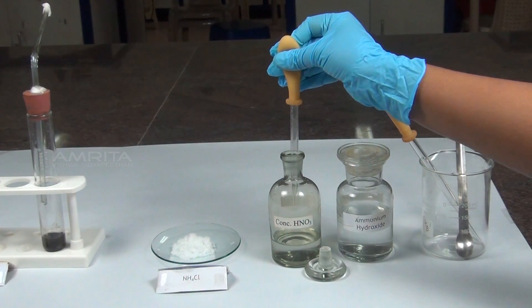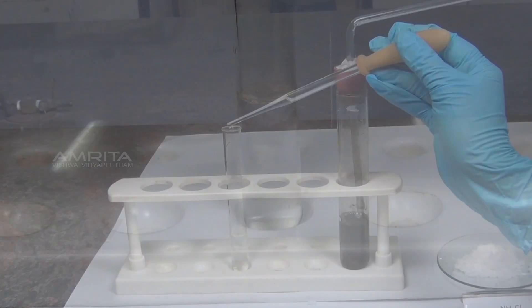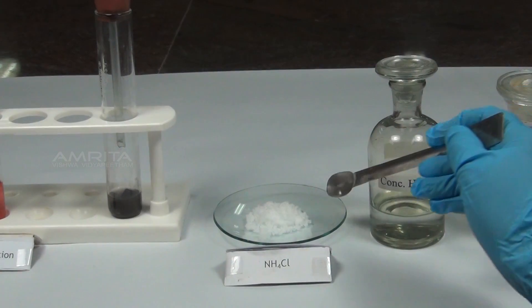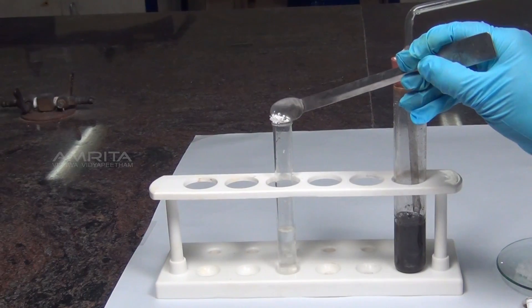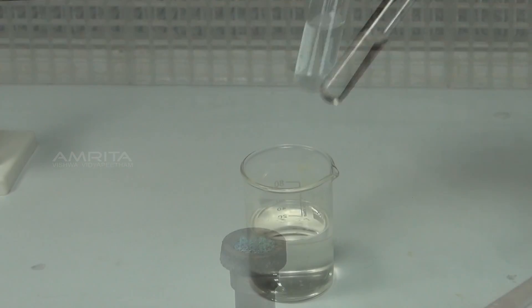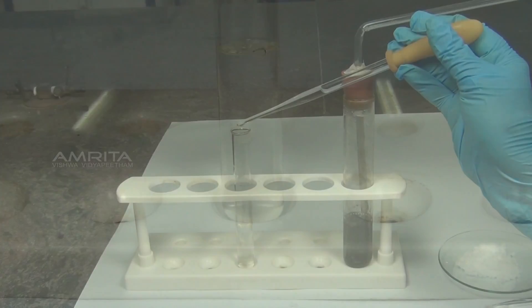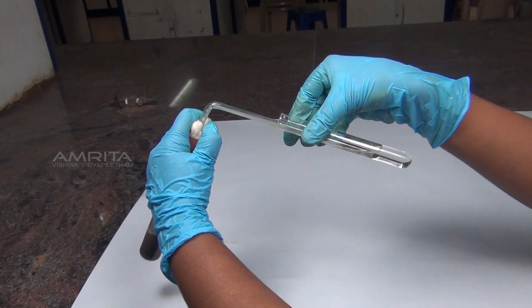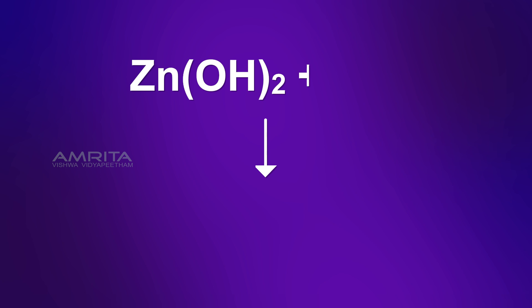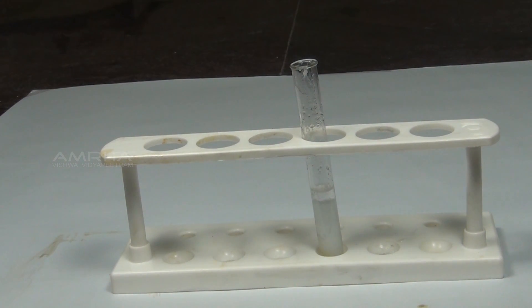Procedure: Take a small quantity of concentrated nitric acid using a dropper and add it into the salt solution taken in a test tube. Boil the solution for some time over the Bunsen burner. Add a small quantity of ammonium chloride to the solution using a spatula. Boil the contents again and cool the test tube in a beaker containing water. Then add excess of ammonium hydroxide solution and shake well. Pass hydrogen sulphide gas through the solution. Zinc 2 ions present in the salt solution react with hydrogen sulphide to form a dull white precipitate of zinc sulphide.